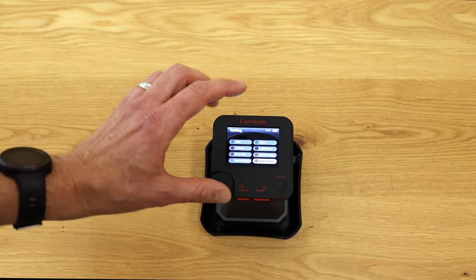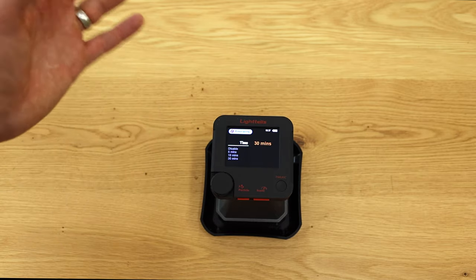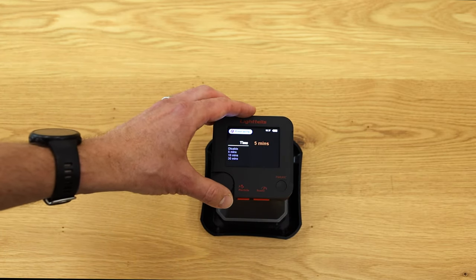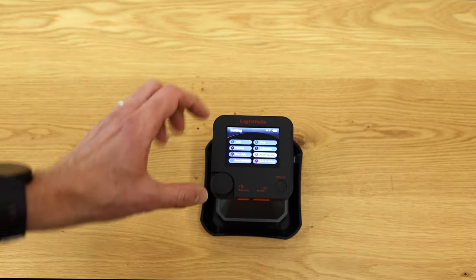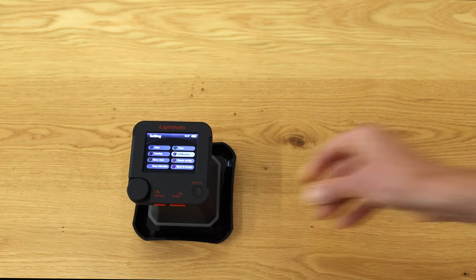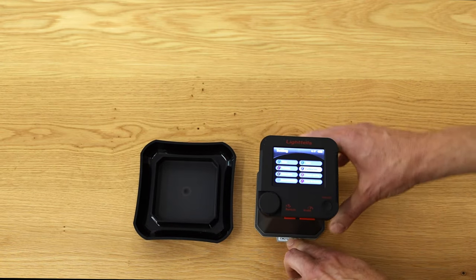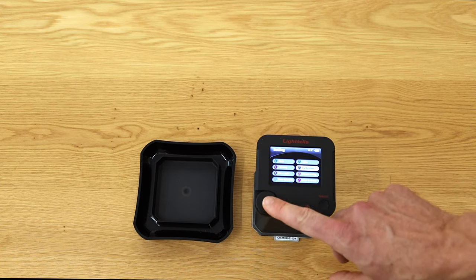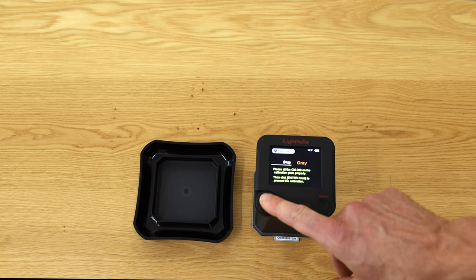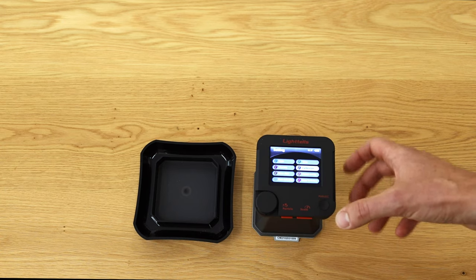There is also a factory reset option, and a power saving setting where you can configure after how many minutes the device switches itself off — options include disabled, 5 minutes, 10 minutes, or 30 minutes. Finally, there is the calibration option. Calibration is rarely needed, but when required you take the little gray plate, place the device on it, press calibration, press Enter, confirm the gray plate is below, and the device calibrates itself in just a couple of seconds.